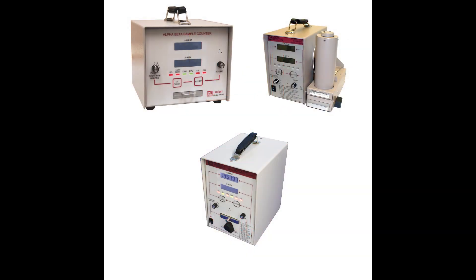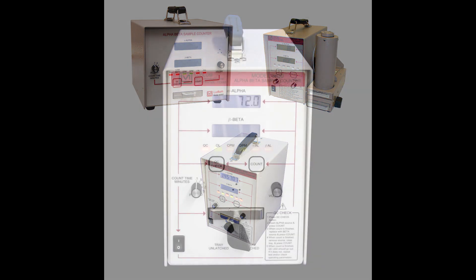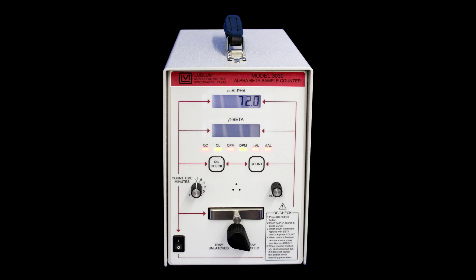The Model 3030 series of sample counters are dual channel counters designed for simultaneous alpha and beta sample measurements. In this video, we will use the term 3030 to represent all of the 3030 variants.